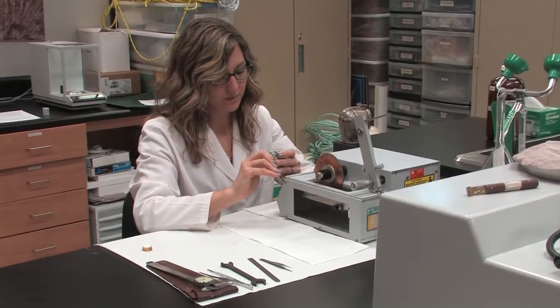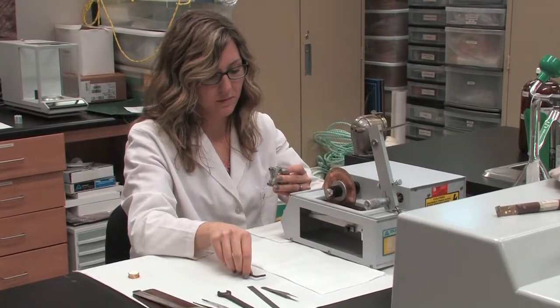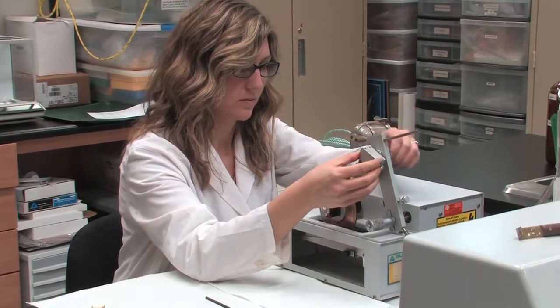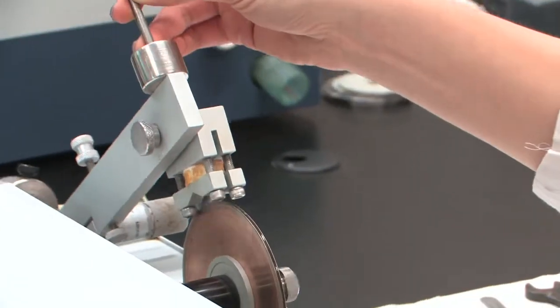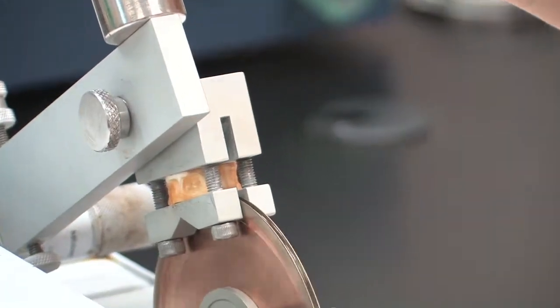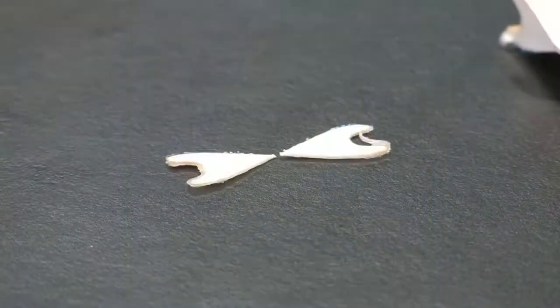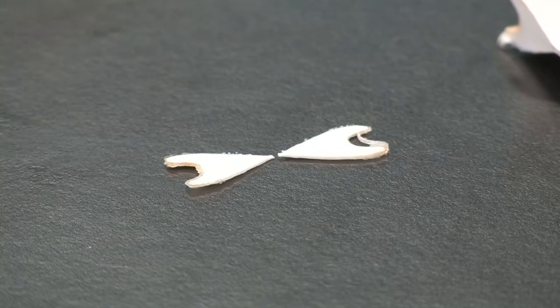When sectioning normal shark vertebrae, a small isomet saw is typically used. The vertebrae is retained in a chuck and cut along the vertical plane using two blades. The cut is made perpendicular to the haemal arch. This cut produces a bowtie shaped section which is then used to view the annuli.